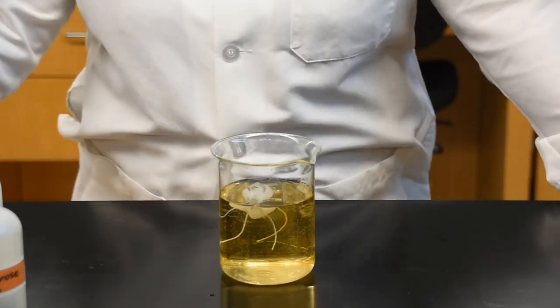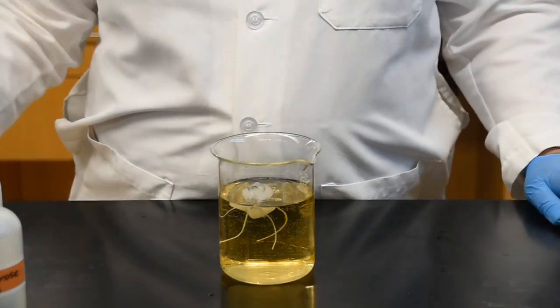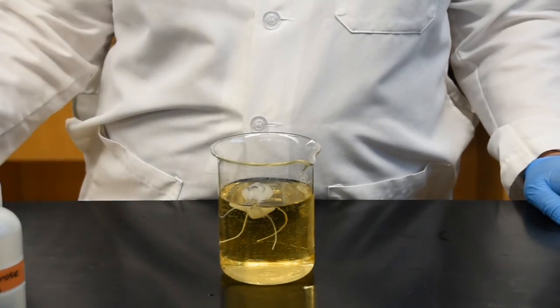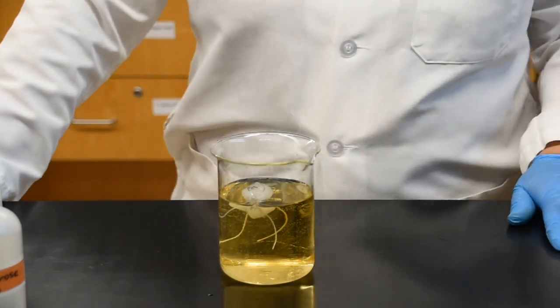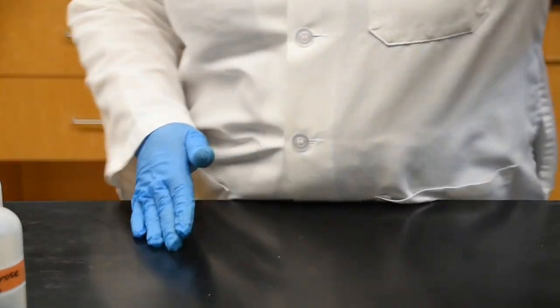So basically, the goal of this experiment is to see which of these molecules involved, my water, the starch, and my iodine, are small enough to either diffuse or move into my cell or out of the cell based on their concentration. So we're going to let this beaker sit for about 45 minutes. We're going to set this aside.